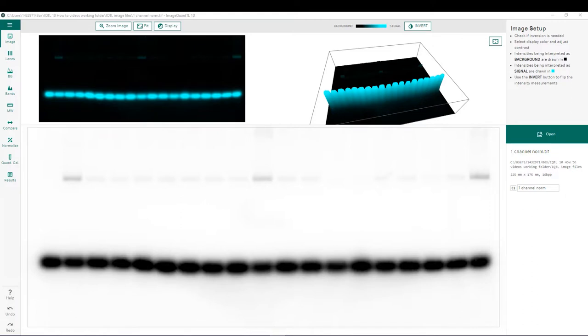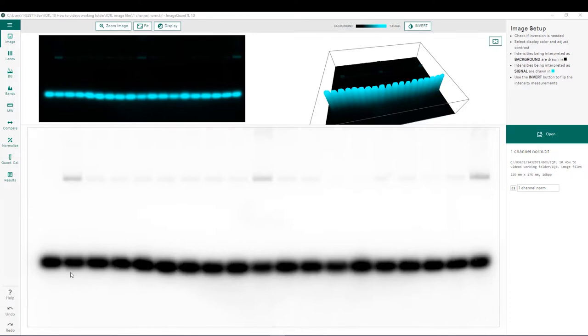The image that we are using for this ImageQuantIO version 10 tutorial video is shown here. You can see we have two bands per lane, one higher molecular weight band of interest, as well as a lower molecular weight loading control shown below.